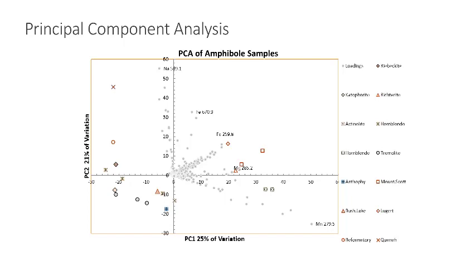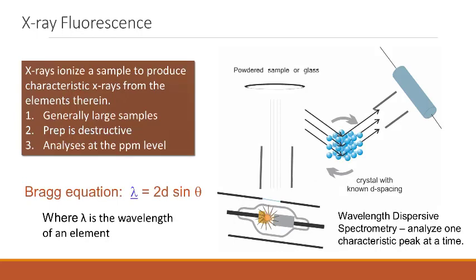Principal component analysis can allow us to say that certain minerals are very similar to one another, while others are vastly different. Again, we struggle with the problem of knowing exactly what those differences are, but we can start looking at things that are comparable to one another with the LIBS. So the LIBS uses UV light in the form of a laser and induces visible and near visible radiation, which is characteristic of the atoms involved. And it's a tad messy.